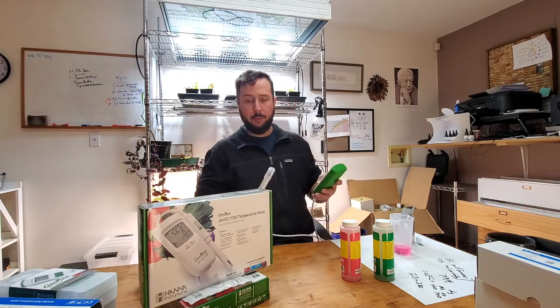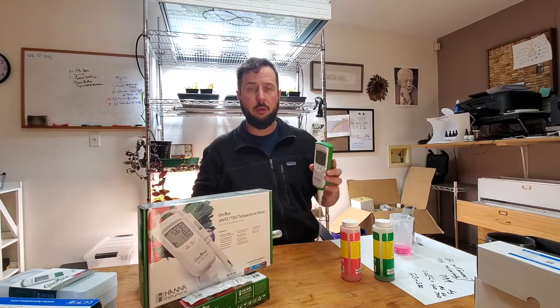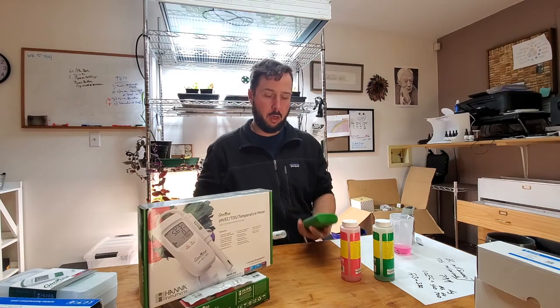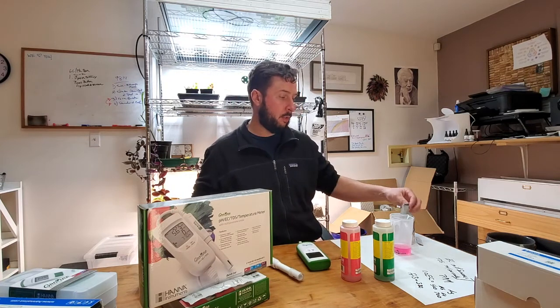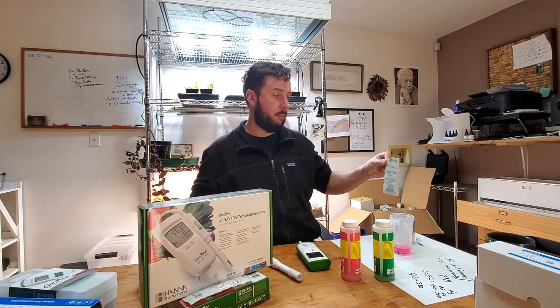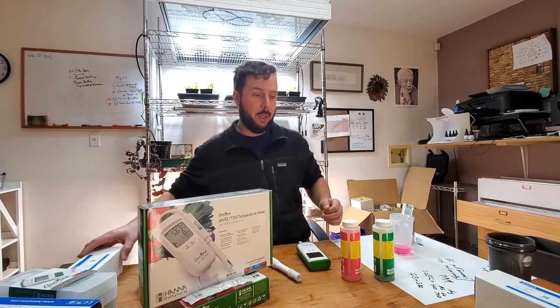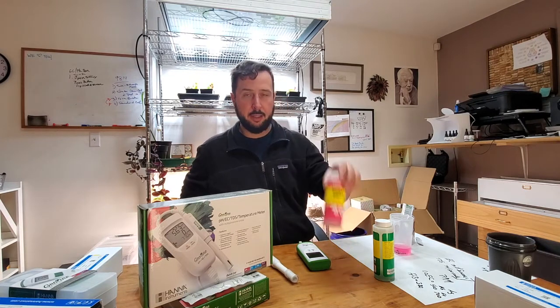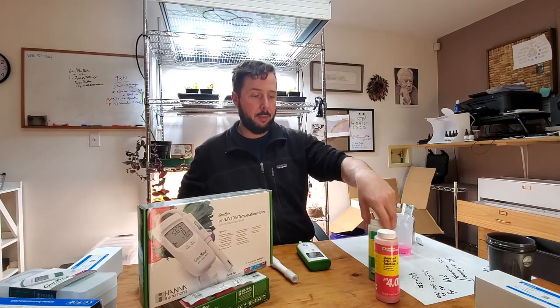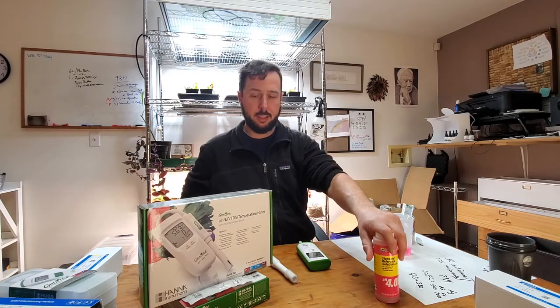A couple final thoughts on this Hanna Growline 9814 all-in-one meter. The quick cal solution is really awesome because it does the pH and the EC at once. If you don't have that or you need to order it, and all your hydro shop has is some 4 and 7, you can do a standard calibration — which is handy because most everybody's got these solutions from old meters.